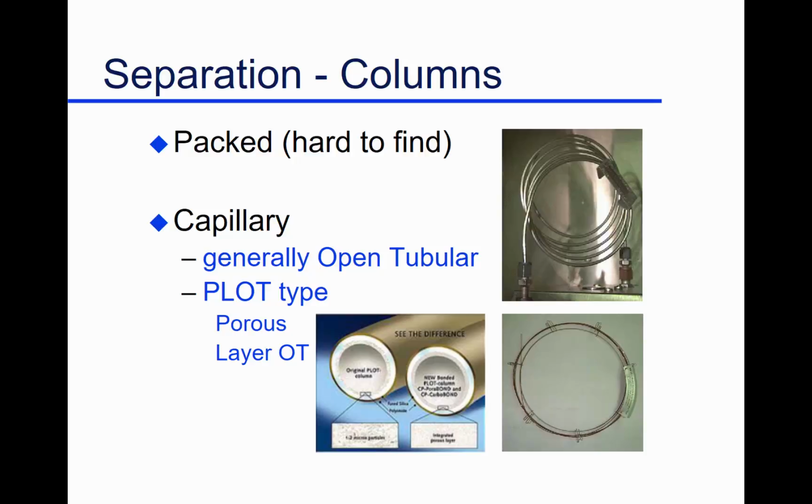Your stationary phase is coated on the inside of the glass. Sometimes they'll put really, really fine material and fix it in here as a granular material, but it's really special applications.